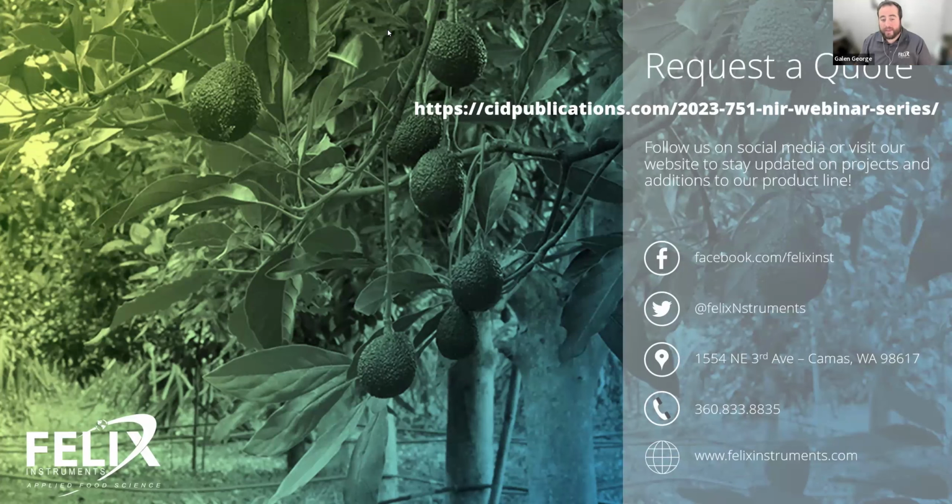And so in that way, we try to provide as many resources as we can to educate our customers on what the actual analytical methodology should be for performing that testing. So that's the long answer, but hopefully that helped clarify for you what you were asking there about how to be assured of prediction accuracy.